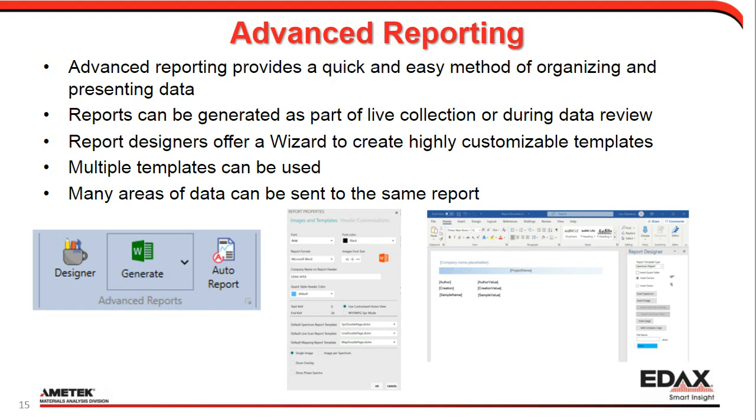Data from different areas can be sent to the same report. There are multiple templates to choose from for each collection mode. The report designer offers a wizard to create your own templates. You can design the layout, determine the items you want to include in the report, insert a company or lab logo, change font size, and so on.